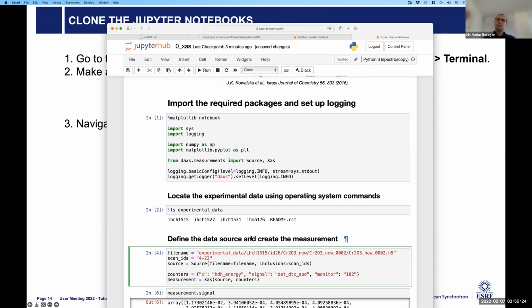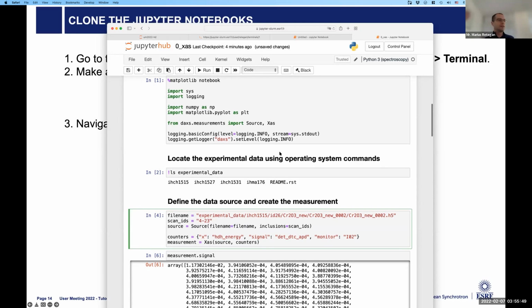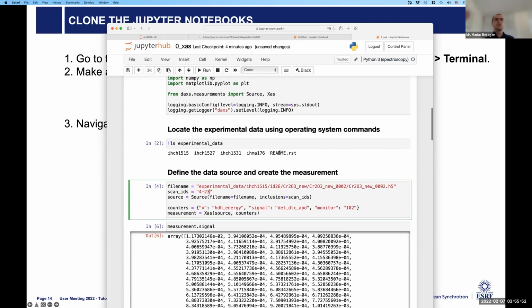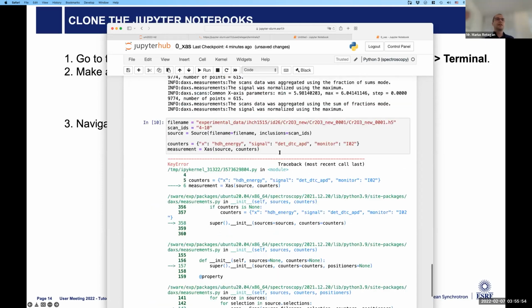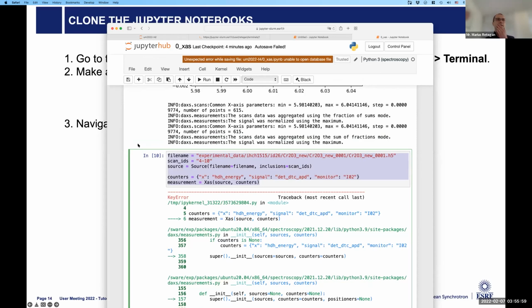I make maybe a couple of scans on each sample, but then we're measuring 20 different samples at the end of the day, or different states of the samples. I do some chemistry, and then obviously I get 10 sets of experiments in, let's say, 10 hours or whatever. So then I would like to analyze finally all the hundreds of data of different samples. Not summarizing the scans, because they are all changing. So I have a reduced sample, an oxidized sample, a sample in contact with something. So we'll end up having many, many data sets, and how do we analyze these?